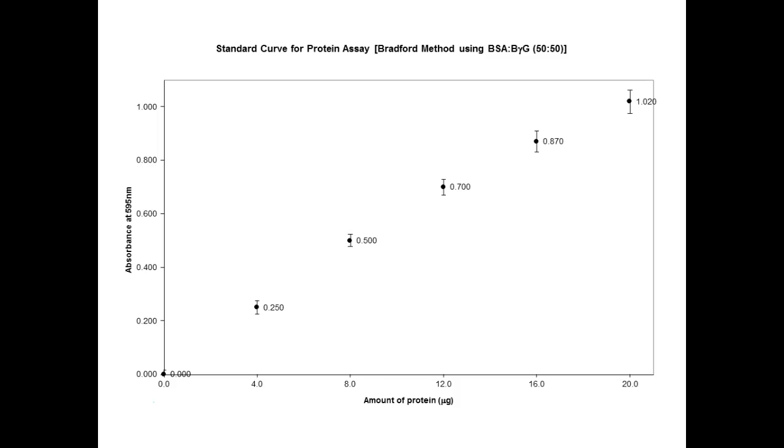And we're going to run a similar test to that, where you can detect the presence of antibodies in the last lab of this semester. But again, we're just going to be asking yes or no. We are not going to put it on the spectrophotometer and actually get a number. But we could do that, and we're trying to work towards that. So you guys get to do stuff that real scientists do.